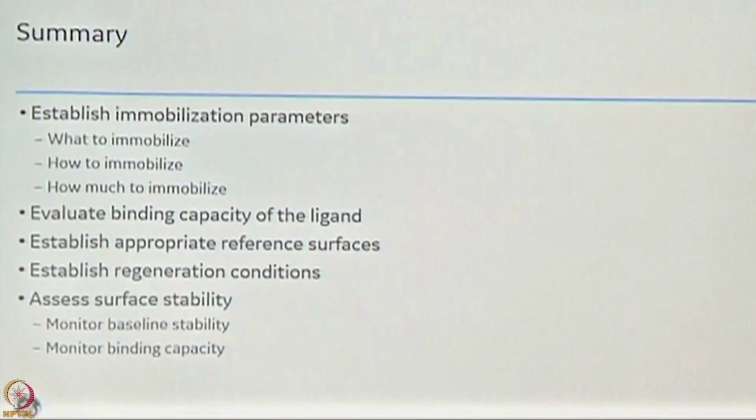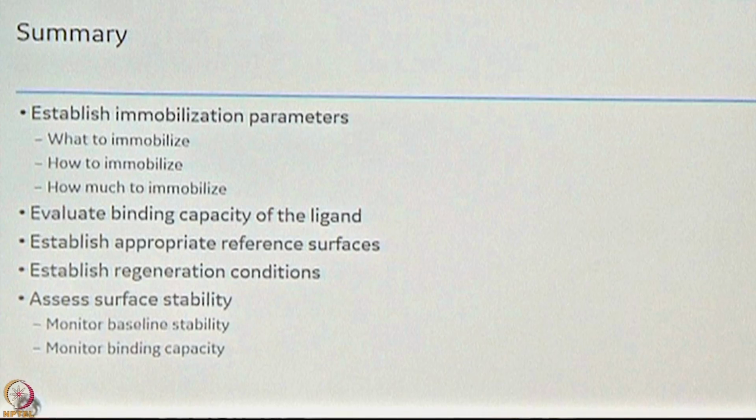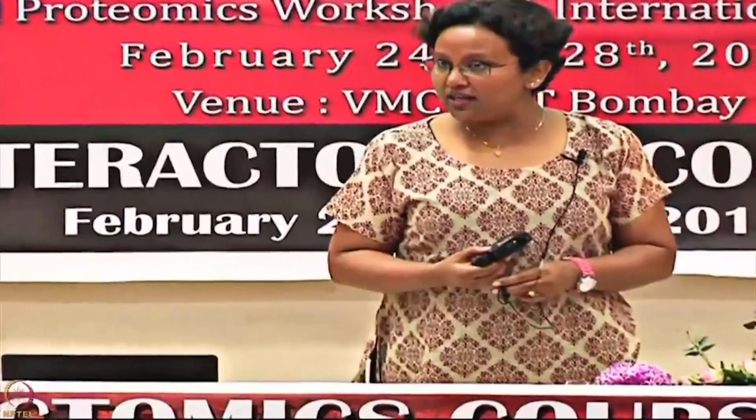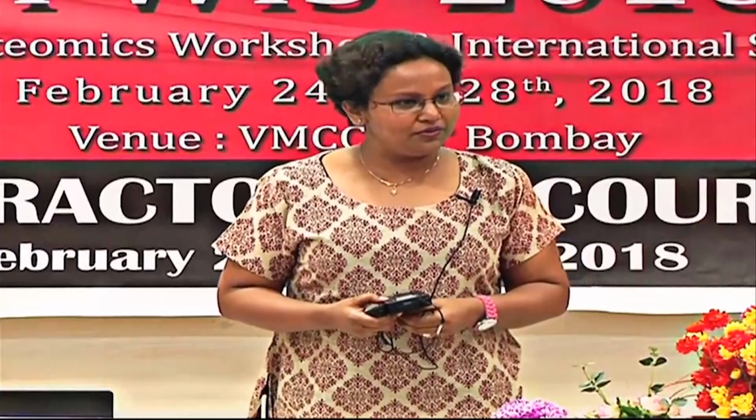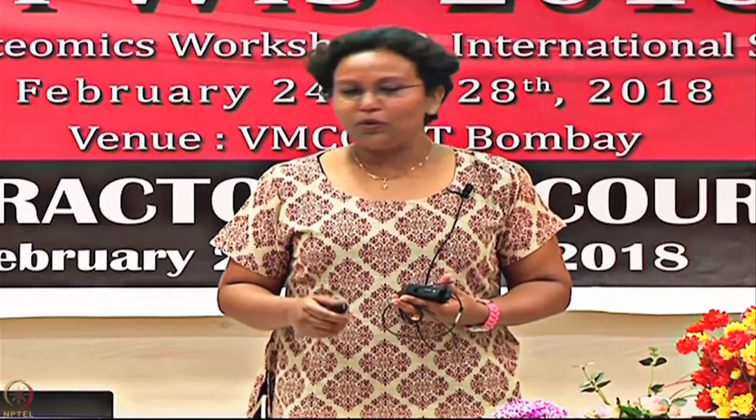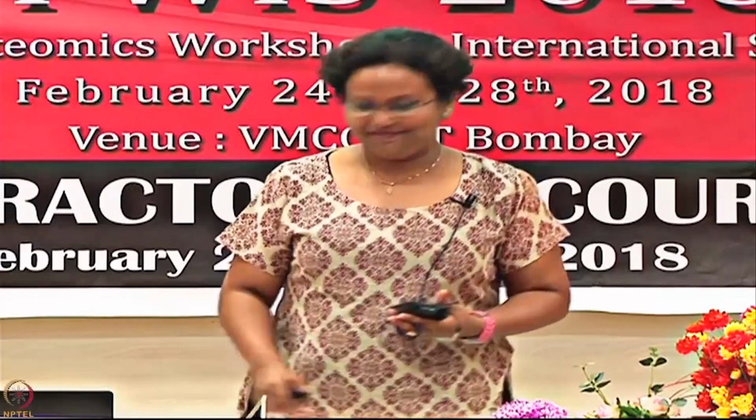I think that is the end of the talk. We talked about some ideas on how you do your immobilization, what things you need to take care of before you run your samples, and your regeneration conditions. I think it will give you a good start when you start with your Biacore assays. Thank you. If you have any more questions, I am happy to answer.